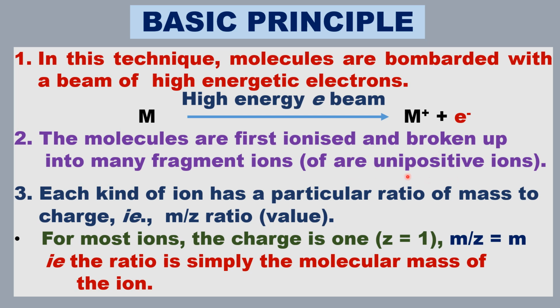Okay, ठीक है। चार्ज क्या है? The ions +1। ओके, each kind of ion, देखिए, several ions formed. Okay, each ion has a specific ratio of m/z value.